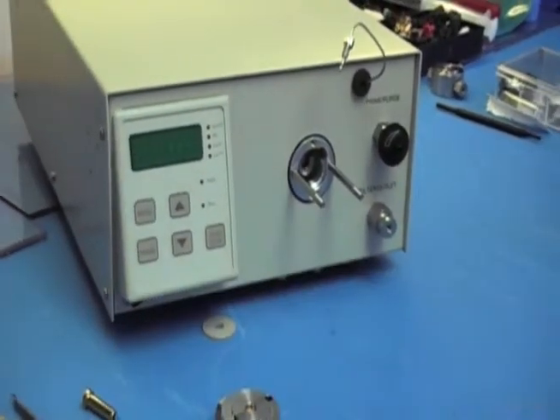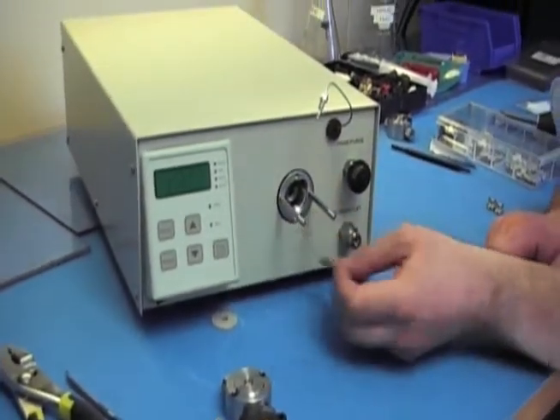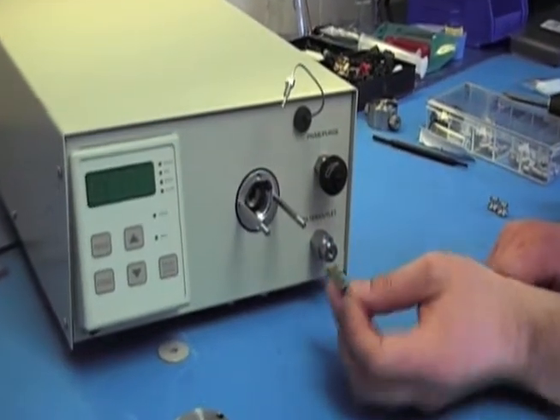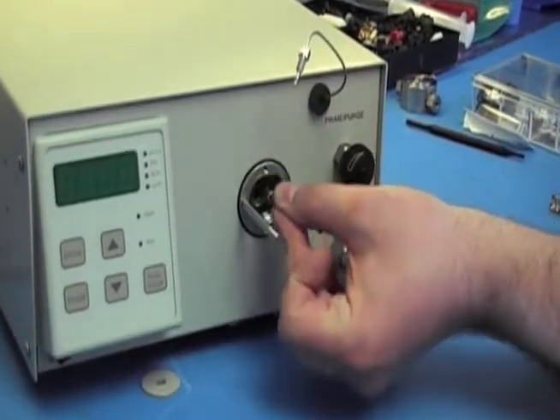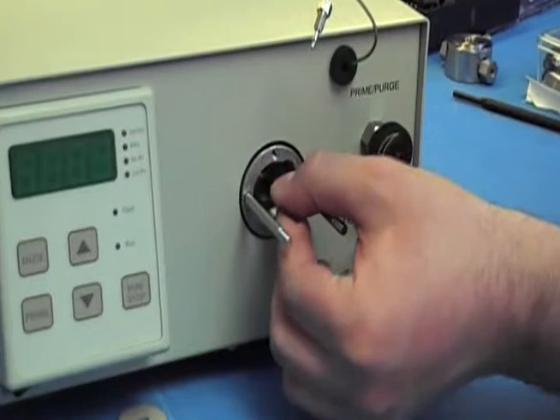Grab your new piston. To install it on the piston arm carrier, it's like a little seat that you have to drop it into. Slide it down.